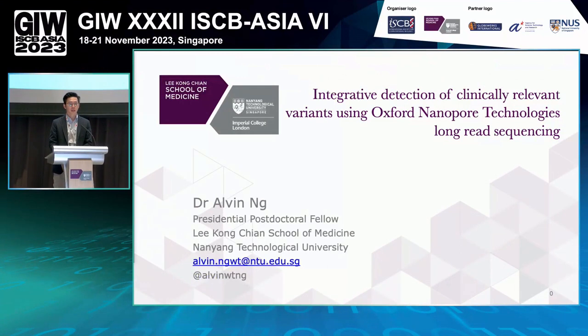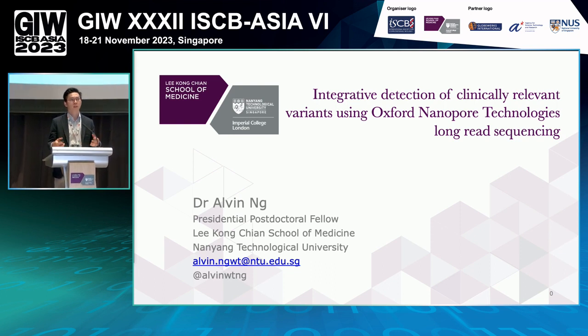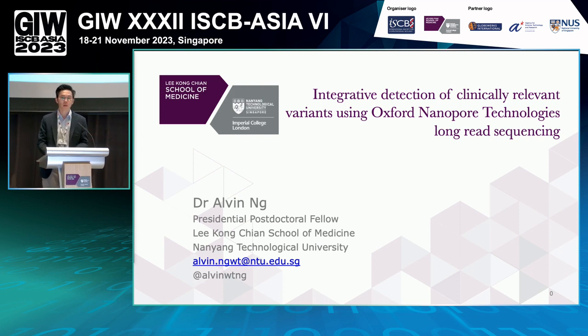So for today, I'm going to give you a glimpse of different applications that you can have with long-read sequencing and how you can have much more information from just one sequencing run. Especially, the emphasis for today is that we're looking at clinically relevant variants as well. That's why, at the end of the day, there are a few interesting tidbits that we can learn about.